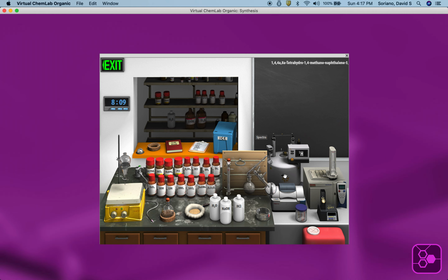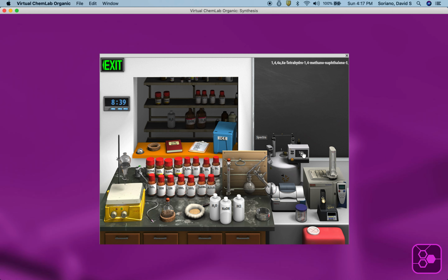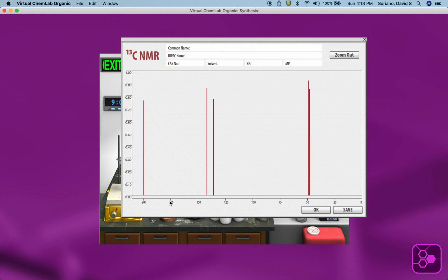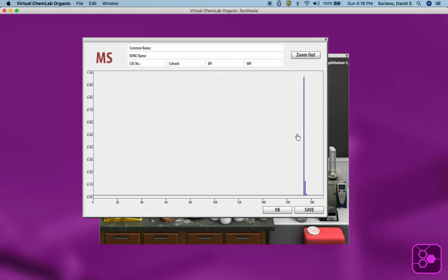Now, let's look at the proton NMR. And we'll click on the H, the proton NMR, to go to C13. And there are the chemical shifts. It's a decoupled spectrum, so we're only getting the chemical shifts. And there's your carbonyl, about 200 in the product. Let's see, mass spec, fragmentation pattern, and the molecular ion is the base peak. That's an interesting one, huh?